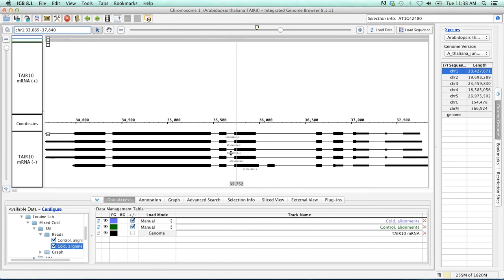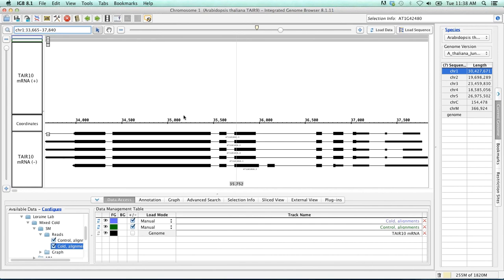As you can see here, there appears to be five different gene models for LHY, and they all appear on the minus strand. So before we look at our alternative splicing data, let's simplify this view a little bit to give us some more space to work with, considering we're kind of jammed up right here.